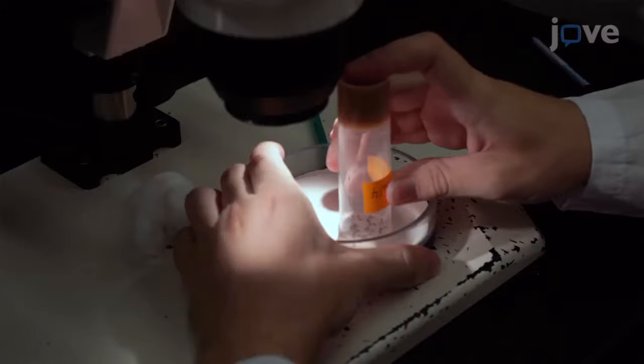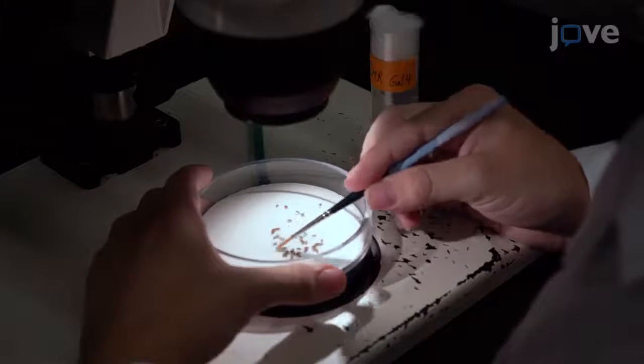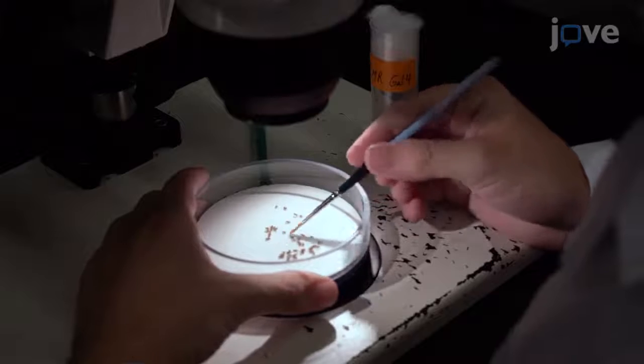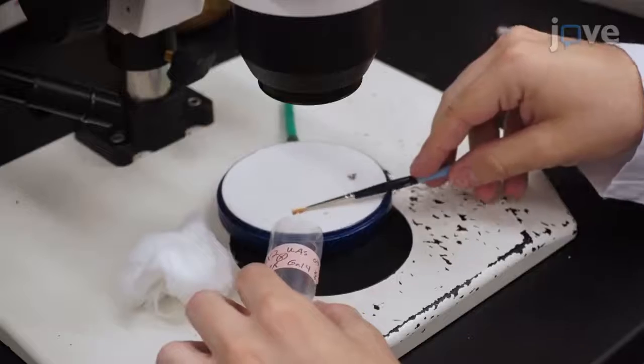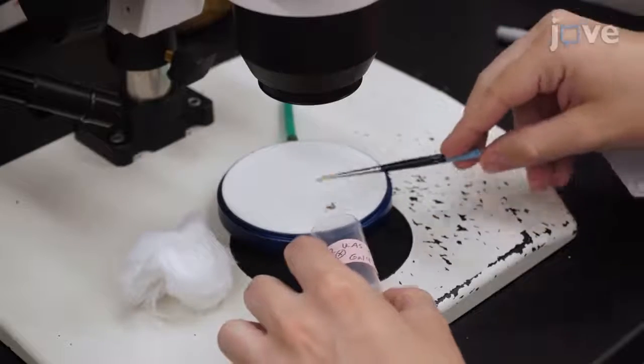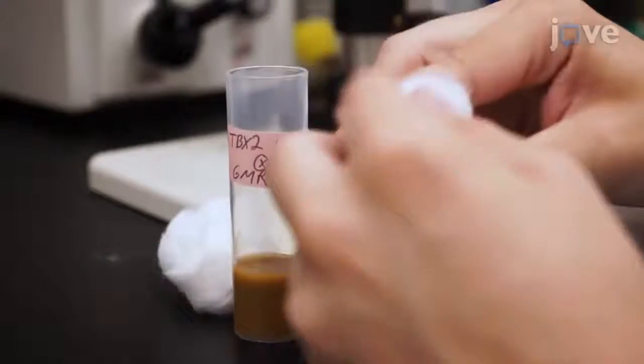To select a specific Gal4 line to express the human proteins in a specific fly tissue, cross 3 to 5 virgin females from the Gal4 line with 3 to 5 males from each of the UAS human cDNA transgenic lines in single vials or in duplicates. Transfer the crosses every 2 to 3 days to obtain as many animals eclosing from a single cross as possible.